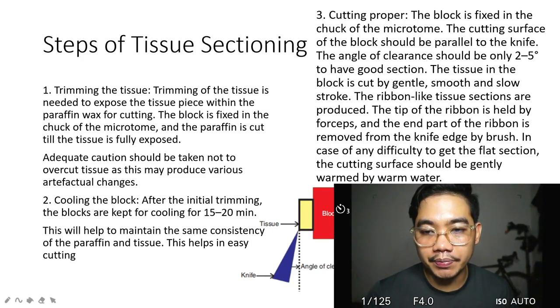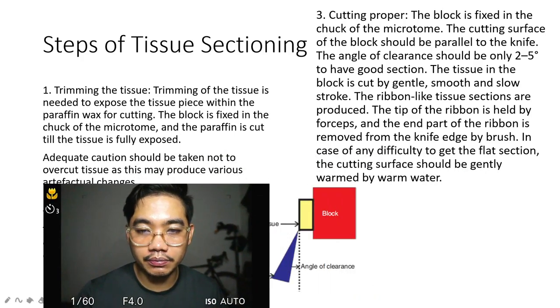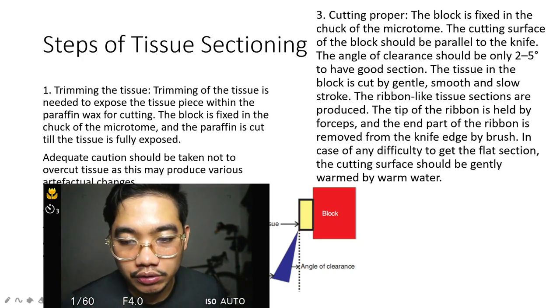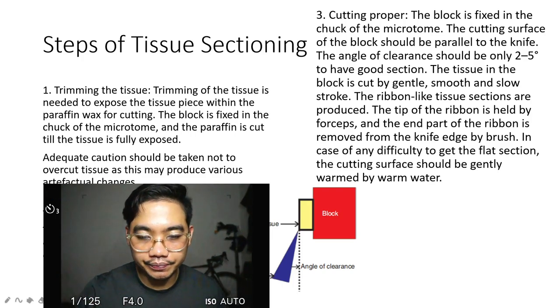So, cutting proper, what Sir Jude did. The block is fixed on the chuck of the microtome. And then the cutting surface is parallel to the knife. So it needs to be smooth, no? You should not stop.